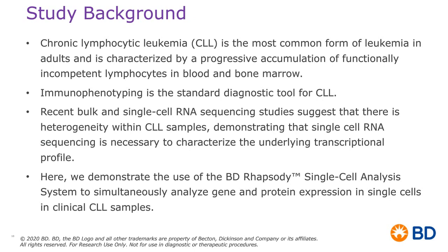And the standard for diagnostics is basically immunophenotyping. You can see that the CD19 positive cells are very clonal. Of course, some of the recent data that people have generated looking at CLL patients has identified that all CLLs are not created the same, and there's significant heterogeneity within these CLL samples.